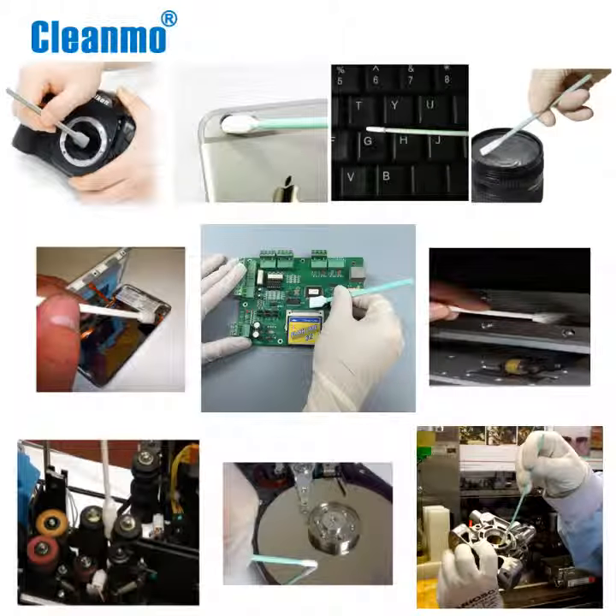Applications include the following: micromechanical cleaning, removing contamination from disk drives, and removing residues and excess materials.